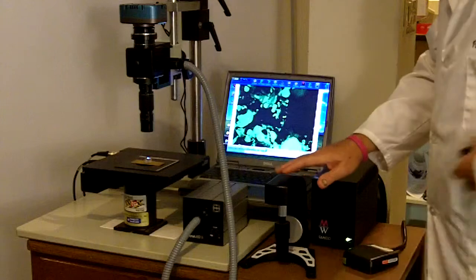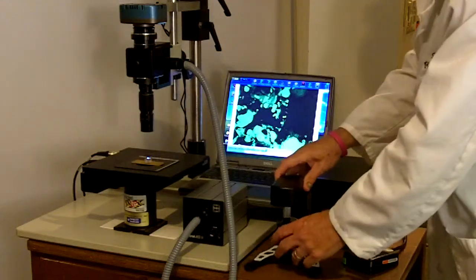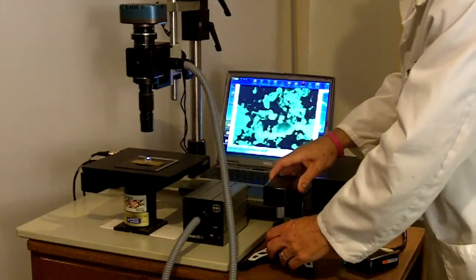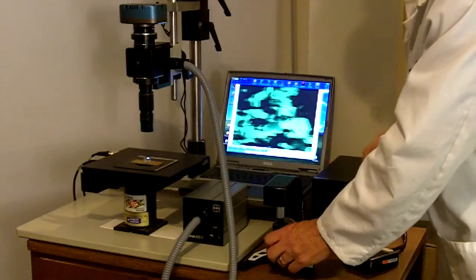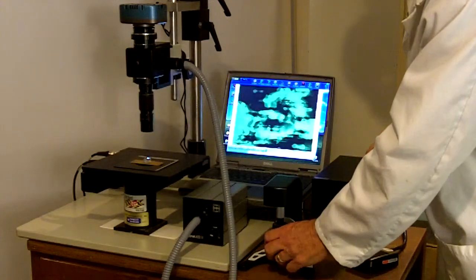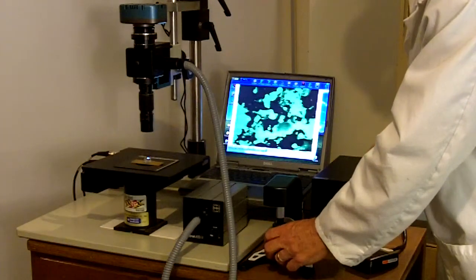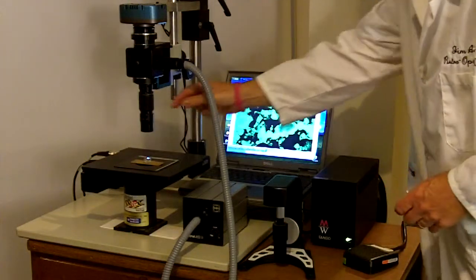And the latest hand control, remote hand control which can be positioned anywhere in the work area. And this is all interfaced to your computer. This is a standard laptop running in Windows.